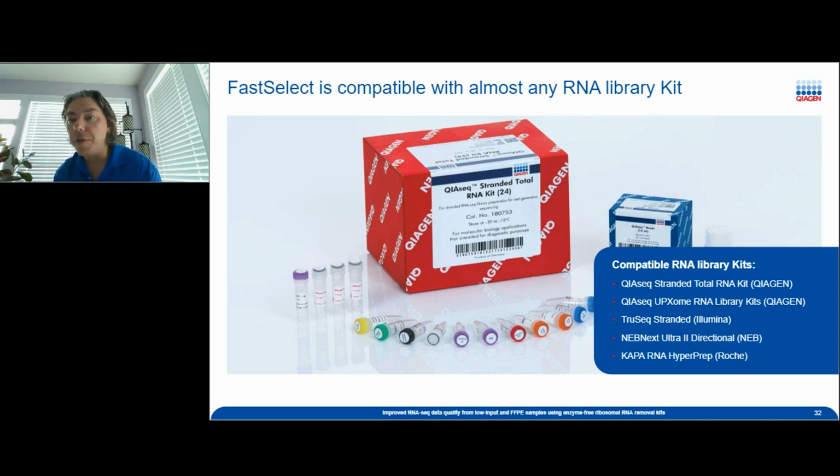We've used it exclusively on short read sequencing because that's mostly what we're doing. However, customers have also used it on long read sequencing. And now there's at least 6 publications that come to mind where researchers have used FastSelect with an Oxford Nanopore device. They basically run the same protocol that I showed you, except they try to limit the RNA fragmentation. So they warm the sample up to about 75 degrees, just long enough to relax secondary structure, have the FastSelect in the solution, cool it down, and then they make cDNA from that.